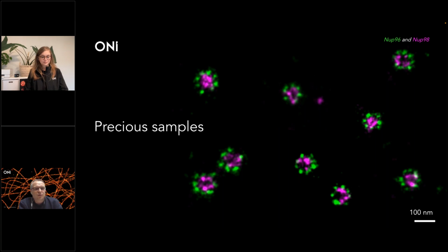So first of all, just prepare your samples normally as you would prepare for flow cytometry. Then you can use the surfaces we just mentioned. So use a polylysine, fibronectin, collagen, and so on. But as I mentioned previously, please optimize that on a cell line, because you don't want to lose your last thousands of cells which you would like to image. And when you optimize that, follow the same strategy. You put your cells, you let them adhere, you fix them, you label them with an already optimized protocol, and then you can do the imaging.